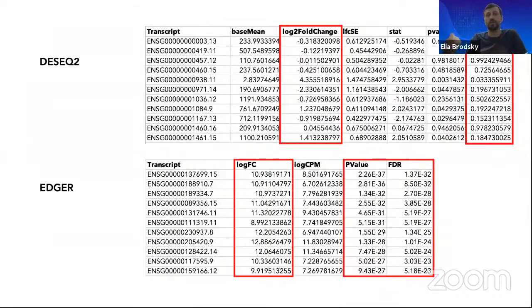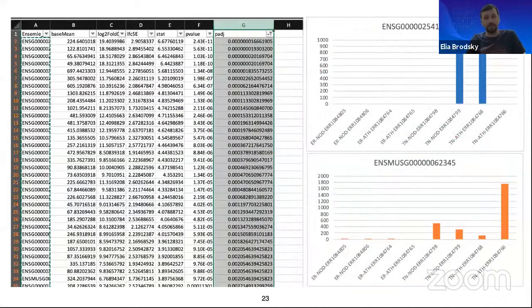In other words, which ones are actually different when we talk about tens of thousands, or even hundreds of thousands, of genes, and how do we select the ones that are most interesting. We'll also look at some examples to understand what variation we should expect in our data and how to differentiate between statistically significant and insignificant variation for our downstream interpretation.